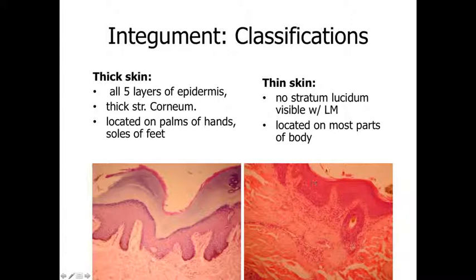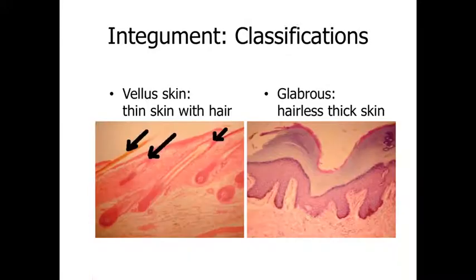And so if we take a look at this, again, thinking about the characteristics we talked about before, epidermis out here, dermis underlying it, so we've got the pinkish staining appearance here. Nice even staining for the papillary layer of the dermis. We've got some white blood cells, some lymphocytes scattered in around here. And then deeper to the papillary layer of the dermis, we have the reticular layer of the dermis. So denser, coarser fiber bundles. Over here, again, papillary layer of the dermis, kind of smooth staining appearance, loose connective tissue. Deeper to that, we've got the reticular layer of the dermis, and we've got those coarse collagen bundles that are going to be present there and interwoven, giving us a lot of strength and integrity to our dermis.